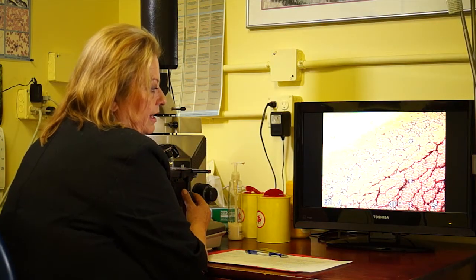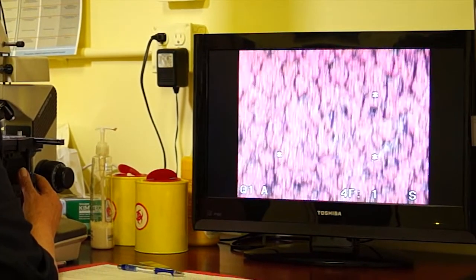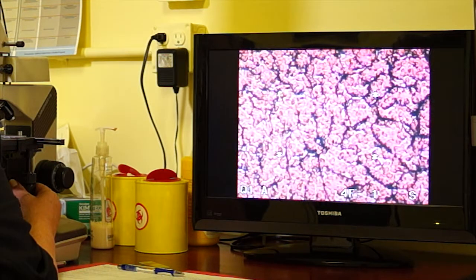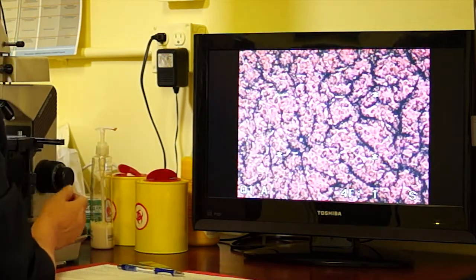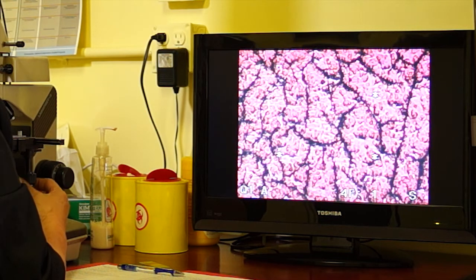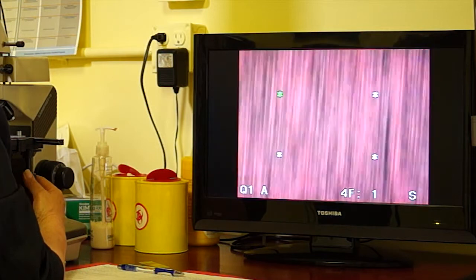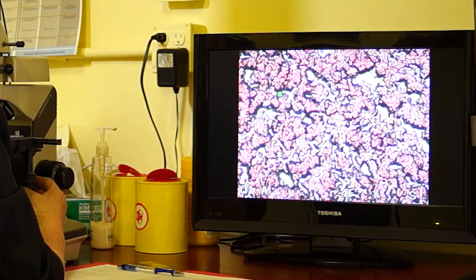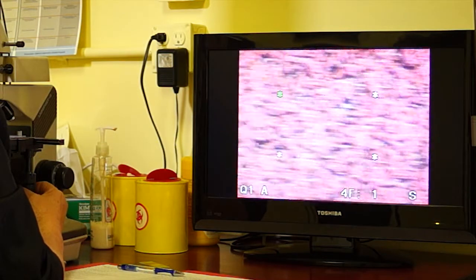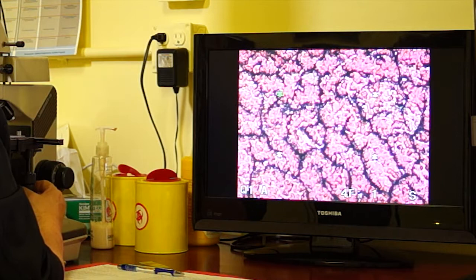This is the dried analysis of live and dried cell. The dried reflects in parts of our body that are holding toxins. And for example, all of these little black bulges are indication of parasites in your muscle tissue. When we go into this, you see how the blood kind of dries funny here, and yet over here, it's dried totally different. This is an indication of thyroid imbalance, which you suspected.